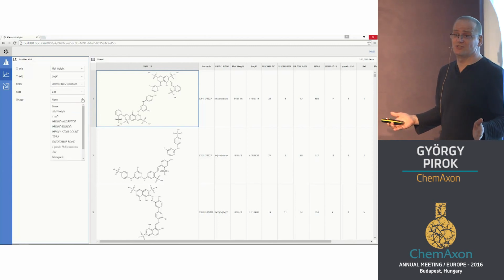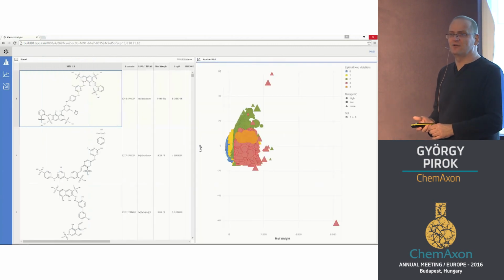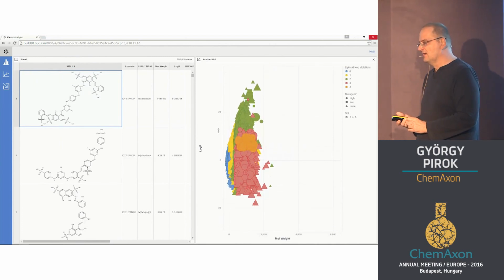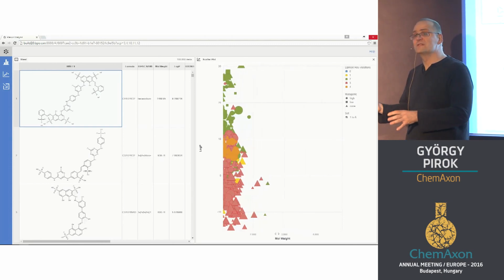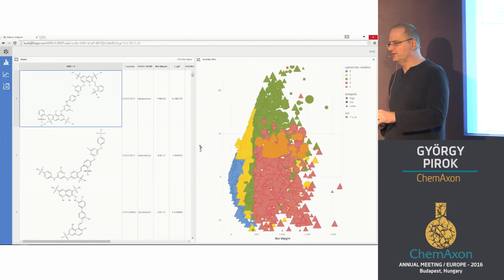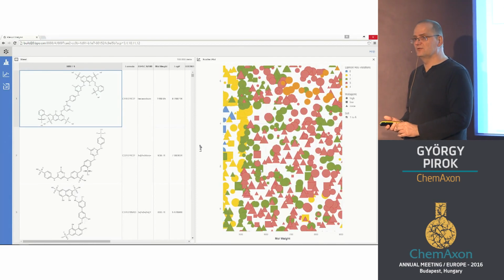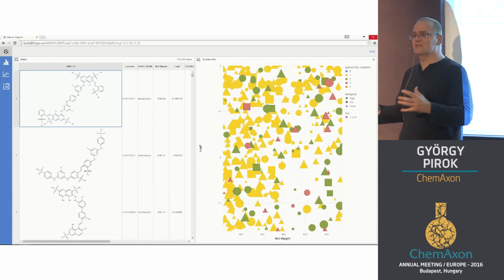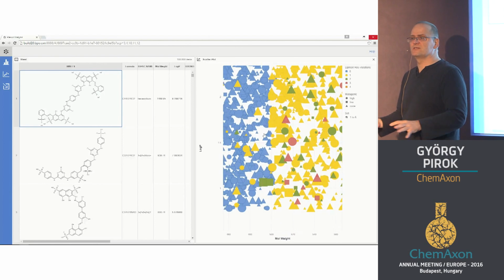And we create now a scatter plot. And a scatter plot is challenging because there you can have plenty of points. In a histogram, you have bins, so that's graphically not too intensive. In a scatter plot, we selected, for example, Lipinski's rules for the color axis. So those show how many rules are hurt by these compounds. And if you move the mouse over the axis and use the mouse wheel, you can scale the individual axis, or you can zoom into the entire data set. And as you zoom in, the data is fetched from the server. So you can explore this whole system like a star field, and you can access all the points of the entire database.